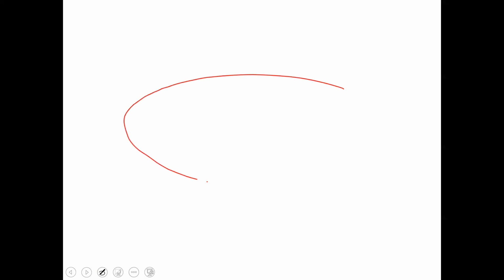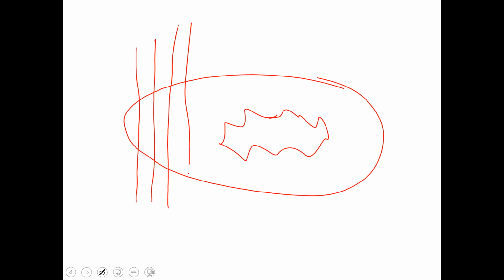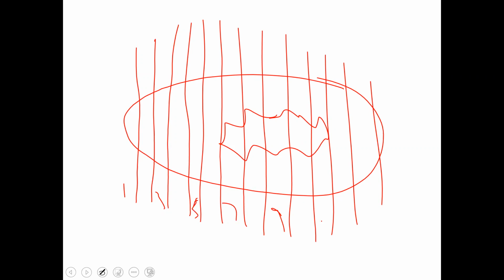So let's pretend for a moment that this is a lumpectomy, and let's pretend that there is a gross abnormality here. One of the key things is that we're going to thinly slice this specimen. So we have this lumpectomy, and as part of the grossing process, we're obviously going to ink, but then we're going to create all these slices. As we create these slices, one of the important things for you when you're grossing the specimen is to be able to report. Let's say this is 1, 3, 5, 7, 9, 11, and I'm just numbering these slices, 13.